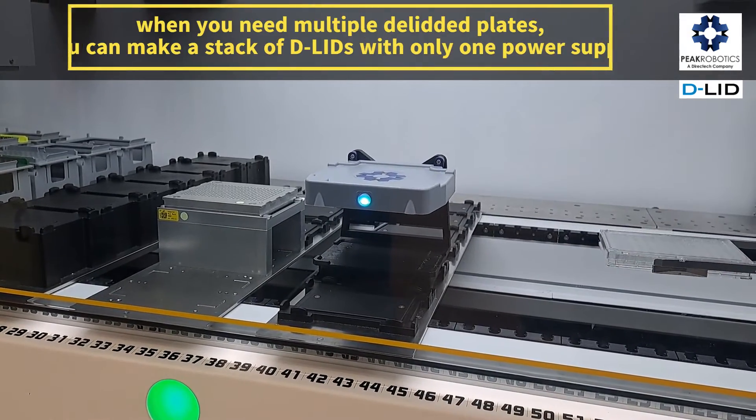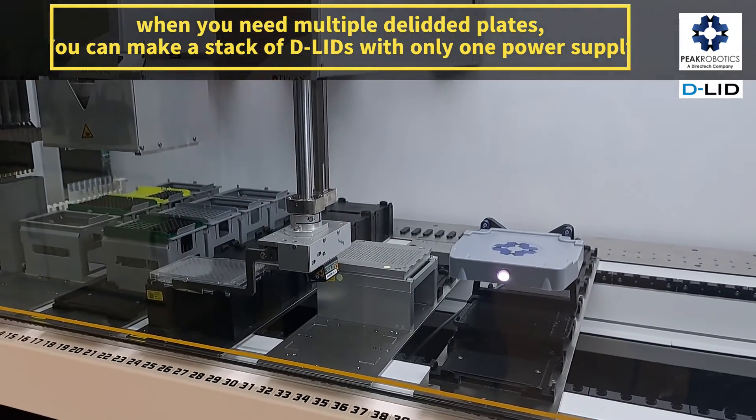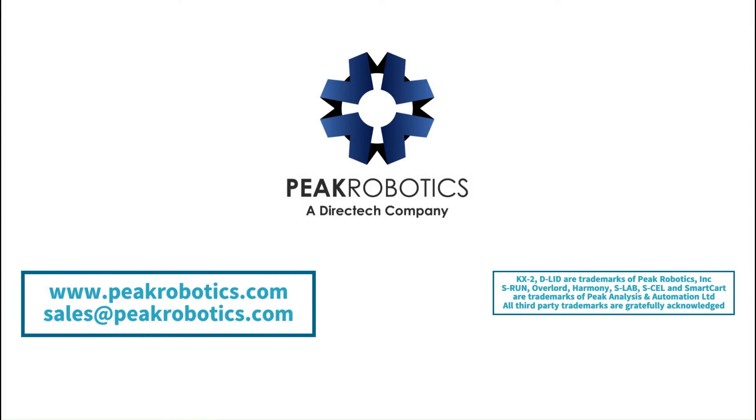When you need multiple delidded plates, you can build a stack of D-Lids with only one power supply. Contact us at the address on the screen for details about this application or any other items in our large automation portfolio.